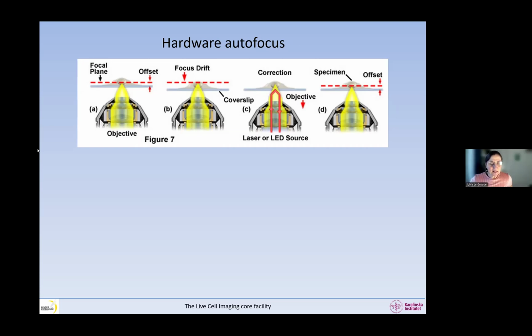Basically, for this type of question where you're imaging vesicles, you're going to want to use a high numerical aperture objective because you need high resolution. The vesicles are often crowded, so you need to differentiate them. In live samples, please use a water objective. That means you have a thin depth of field, and this is the typical thing where the software autofocus fails, because you're going to have vesicles in focus at different Z levels. The only thing you can do to compensate is really to take a Z stack, which is not very good for live sample imaging.